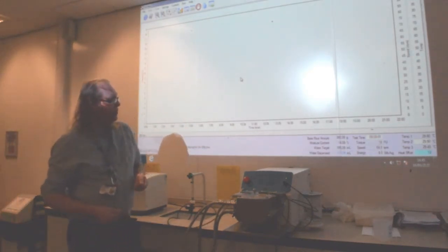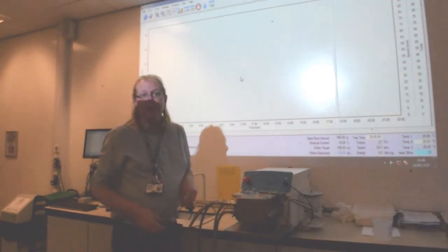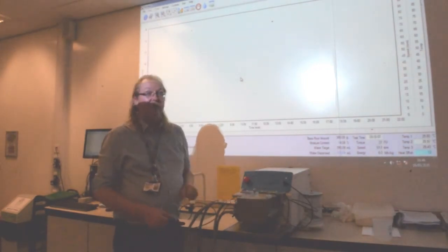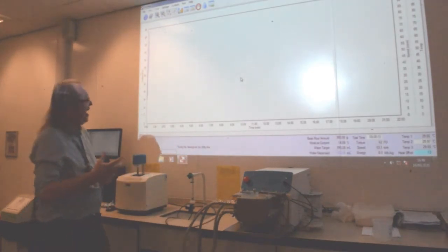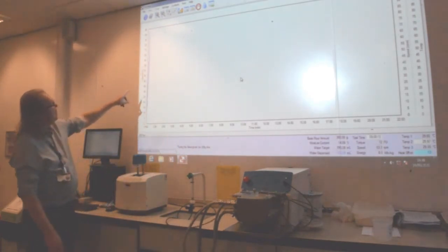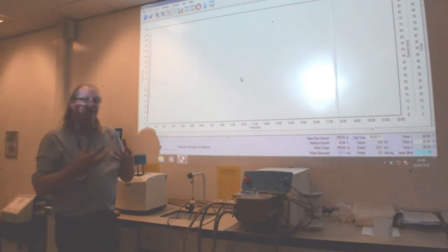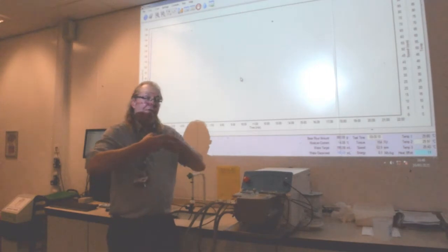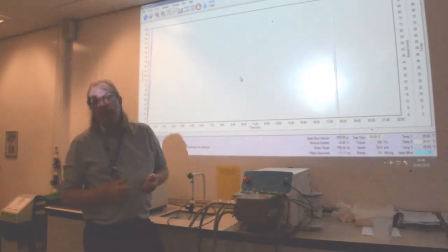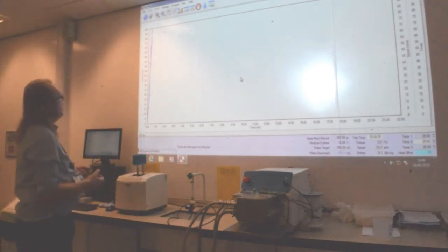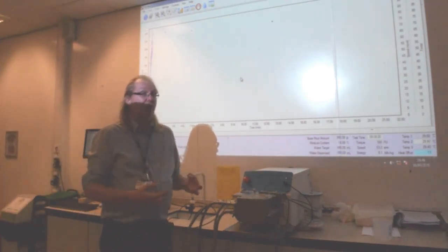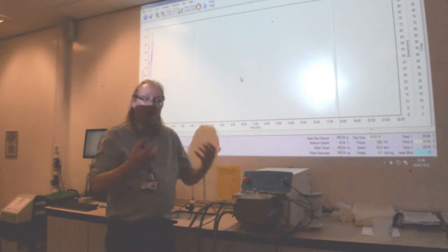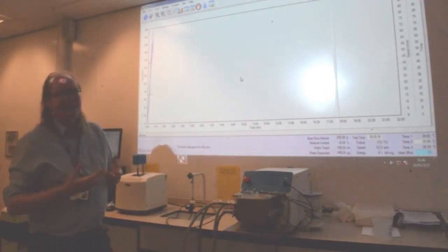We're just coming up to the test time, and now the machine is adding the specific set of water into the mixer, and we will start to see a trace appear on the main screen. What that is measuring is the force that the blades are exerting on that dough. Obviously, as it becomes less of a powder and more of a dough, more and more energy is required to mix that dough.